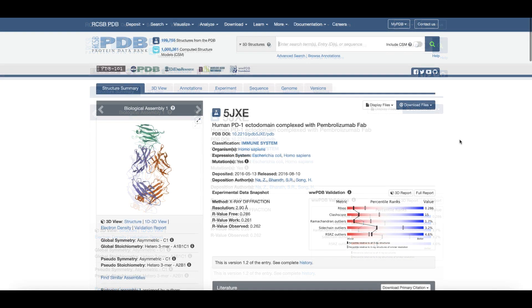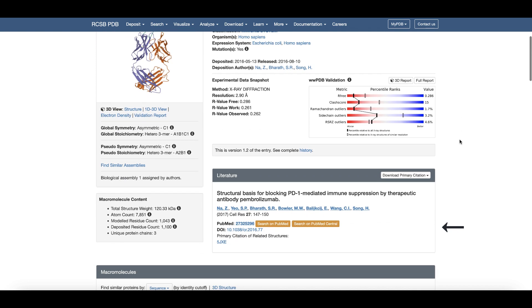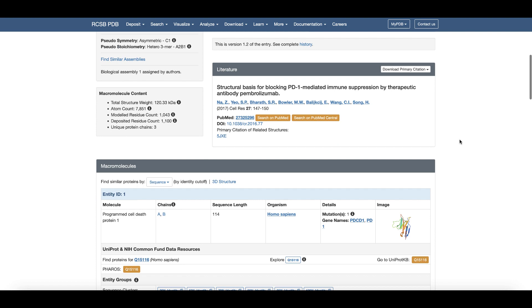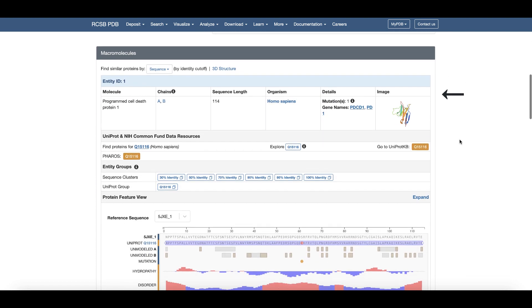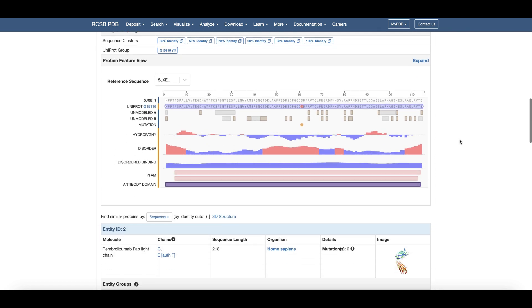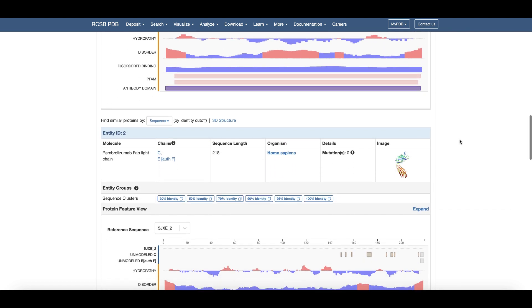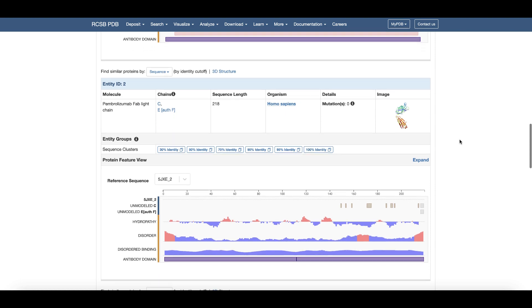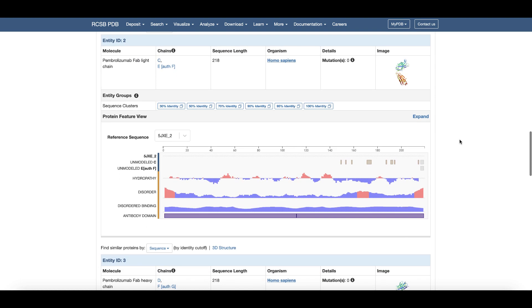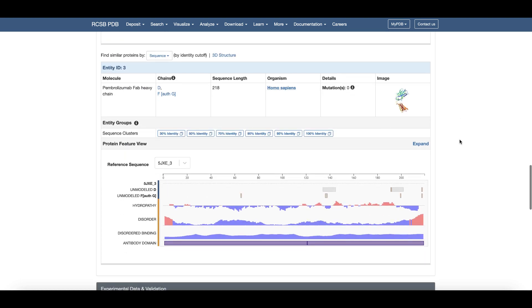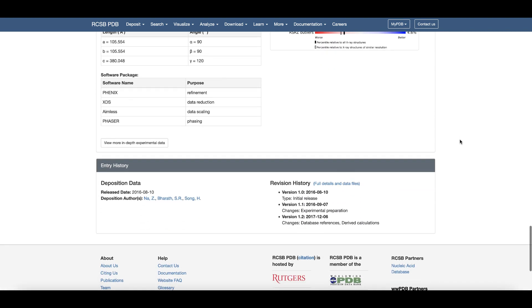As you scroll down, the literature section provides information about and links to the publication describing this structure. The macromolecule section provides detailed information about each of the protein chains present in this PDB structure, that is the PD-1 protein fragment and the heavy and light chains of the pembrolizumab Fab. More details follow concerning the structure determination, structure publication, and revision history.